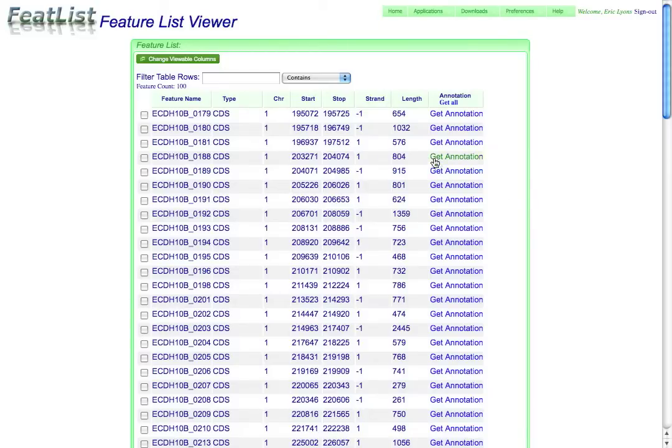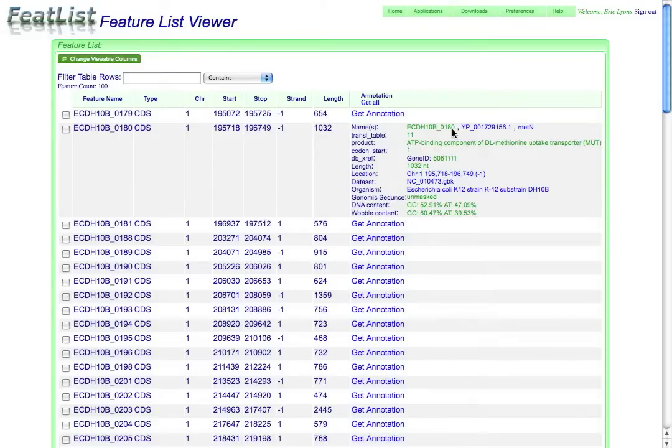This tool allows you to get additional information about one of these features. So in this case, if I wanted to get the annotation for it, I click on the get annotation and get it.